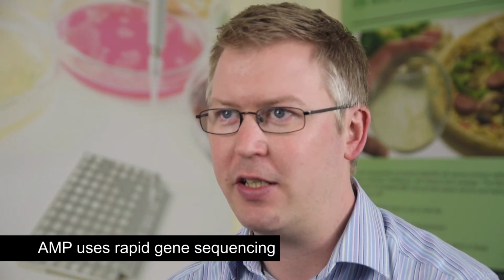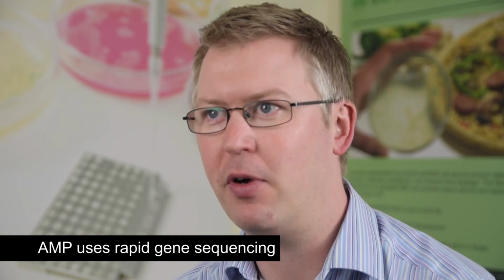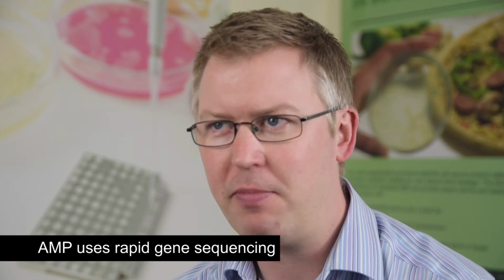AMP is a technique based on recent advances in sequencing technology. Before, we could only sequence a single DNA molecule from an isolated microorganism. Now we can sequence many thousands of molecules without the need to culture the organisms first. This means we can cut the culture out of the analysis and go straight to the sequencing. This gives us the ability to sequence a large number of different species all at once and then identify those species, giving us a less biased picture of the population of a particular microflora.